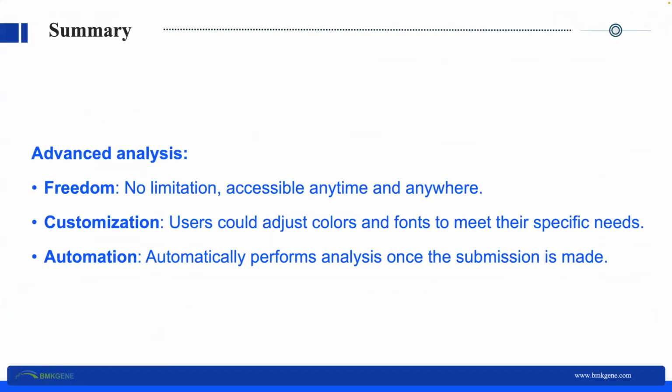Let's summarize here. There are some characteristics of BMKCloud in advanced analysis. The first one is freedom. You have no limitation to using advanced analysis tools. You can use it anytime and anywhere you want.